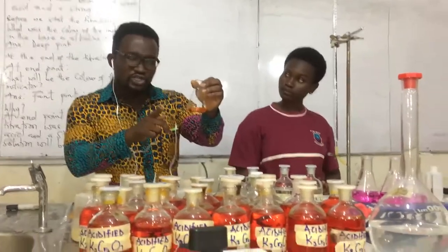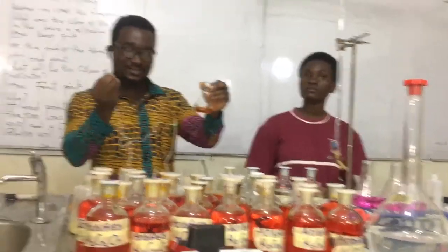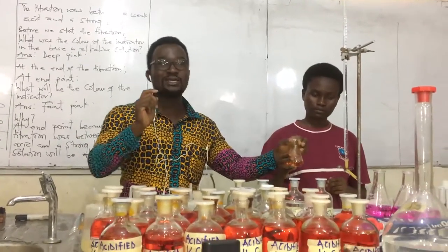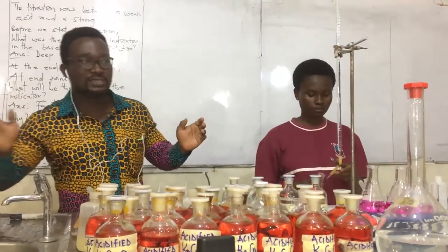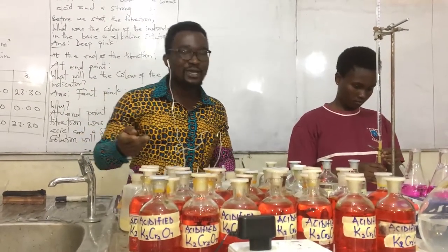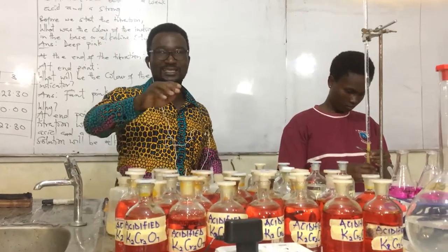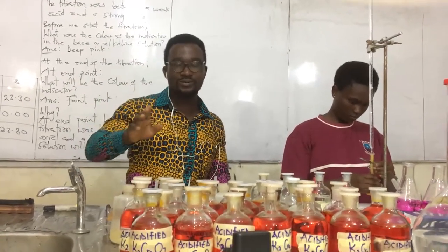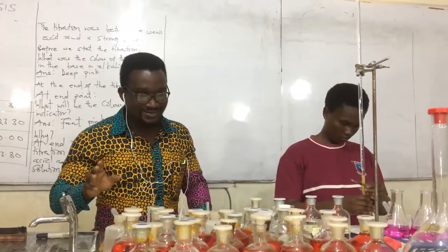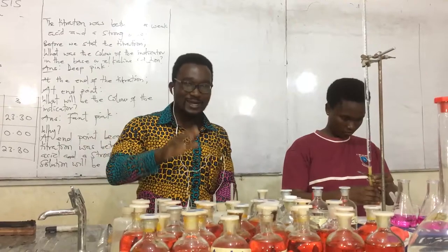So the color change we expect is supposed to be orange. Remember, changing from yellow to orange is light. Therefore, that is what mostly tricks students. They pass the endpoint, they get red, pink, and so on. In fact, we want to systemize our science. The way they have been able to do it, we can also do it.